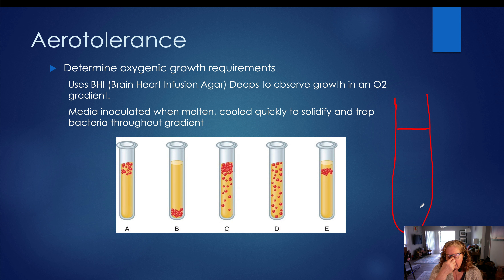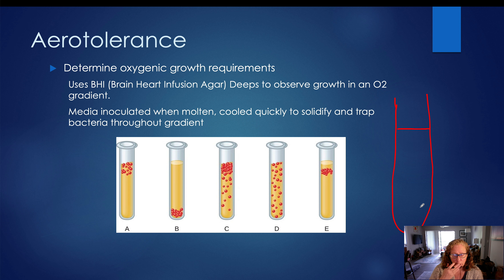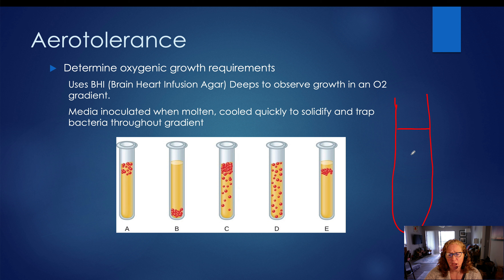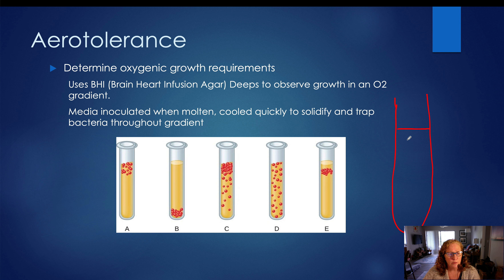When we take the deeps out of the autoclave, we then put them in a hot water bath. The hot water bath is cooler than autoclaving temperatures, but it still keeps our agar in a liquid or molten form. As these tubes sit in that water bath for several hours, they begin to absorb oxygen. So oxygen starts to get reabsorbed into the media and it diffuses from the top of the tube to the bottom.